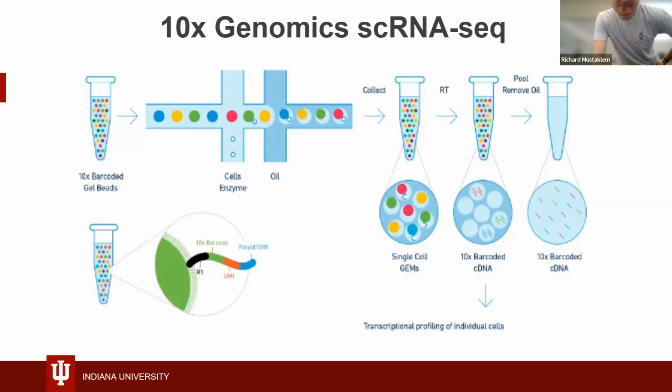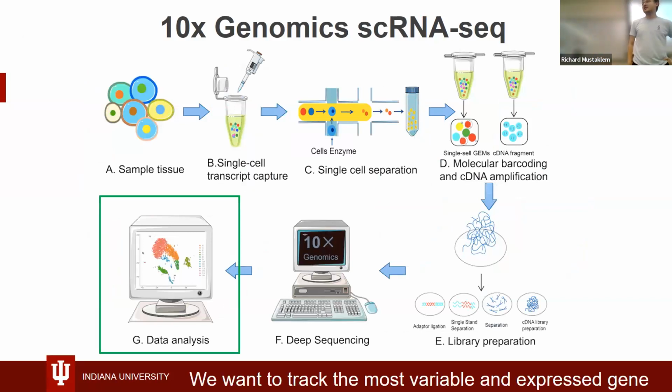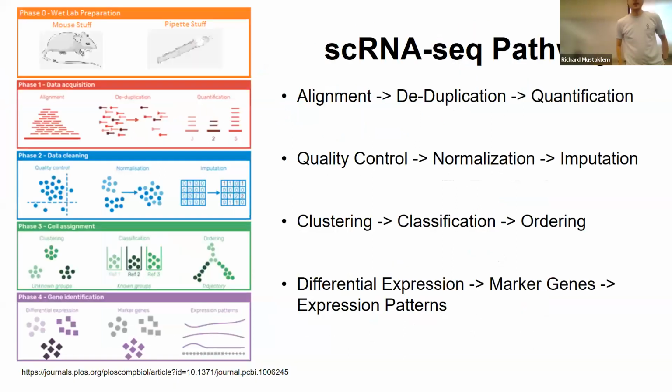Okay. So moving on. We just covered the first 4 steps, and we got a little bit into library prep. After library prep is really where the nitty-gritty work starts to happen. We're going to skip deep sequencing because this is a giant beast in and of itself. What I wanted to focus on today was data analysis. Data analysis has many steps to it, and I'm going to show you what I'm talking about.